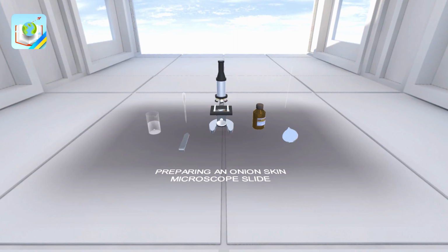Having conducted our interesting study of the onion skin microscope slide, we can now conclude that the nucleus, cell envelope, and plasmodesmata are best observed under an optical microscope. Crystals of large inclusions have been seen in individual cells.